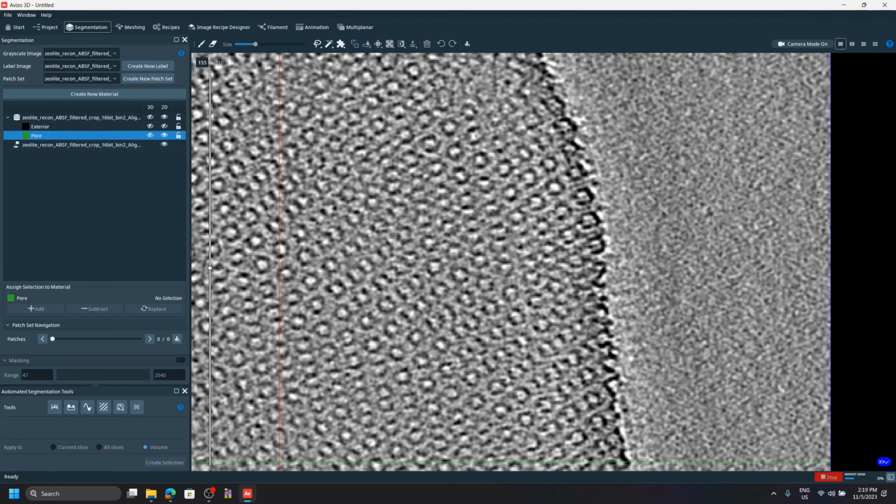So I'm gonna do some manual brushing here to create some samples. I click the brush button here on top. Hopefully you can see the circle, that's the size of my brush. It's too big, so I'm just gonna adjust the size. Because I'm lazy, I'm setting it to the size that's exactly the same as these pores.